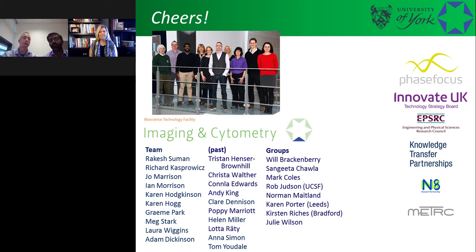A lot of the other QPI systems out there are great if we zoom into one cell, and sometimes this is why we've got the other system, for getting that really fast temporal and spatial resolution information out of it. So the two types of techniques are really complementary. You'll hear more of that from some of the other speakers throughout this series.